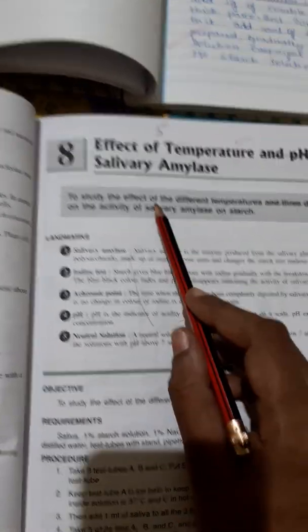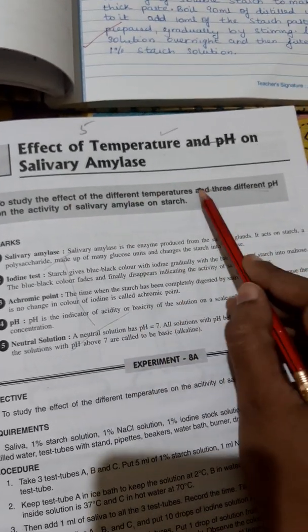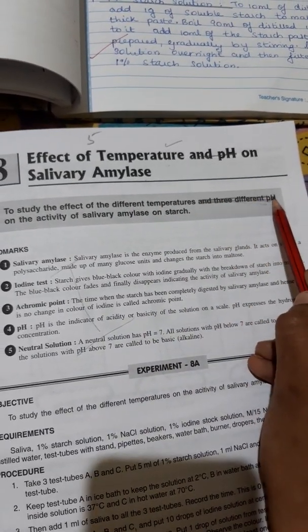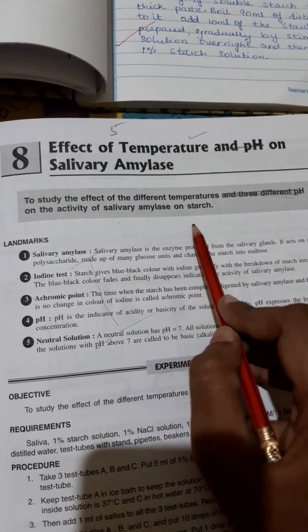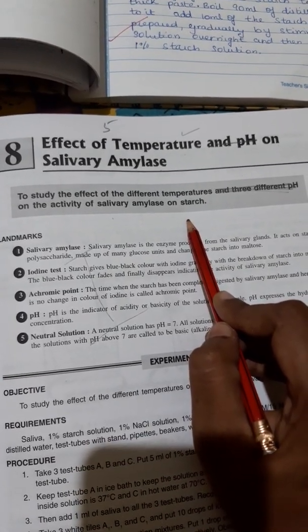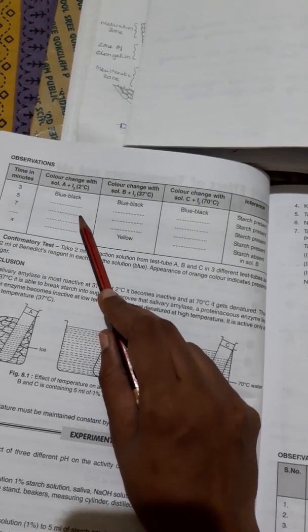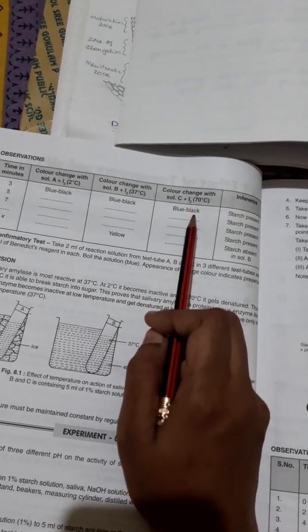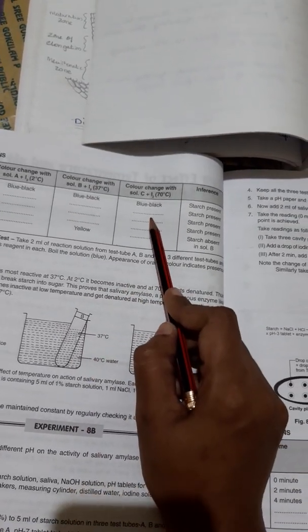Okay. So in the heading you have to write to study the effect of temperature. No need to write three different pH. Temperature on the activity of salivary amylase on starch. Children, it is one of the major experiments. So, in our laboratory, we are taking three different temperatures: normal temperature, very low temperature and high temperature. Okay. 2 degrees Celsius, 37 degrees Celsius and 70 degrees Celsius.